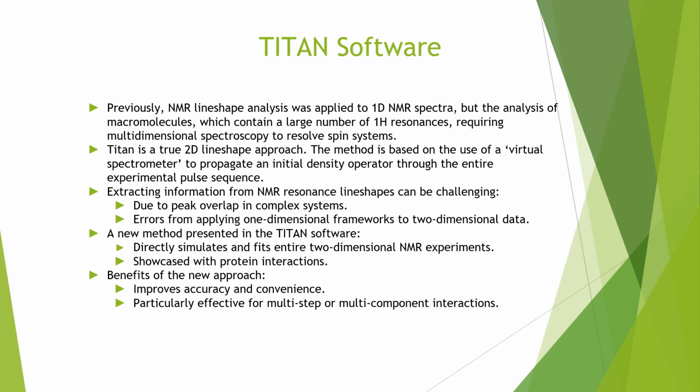This software is useful as it improves accuracy. It utilizes the bootstrap error analysis method based on resampling fitting residuals in 2-dimensional blocks. This is a unique aspect of the bootstrap error analysis method, as it considers correlation between neighboring points and provides more precise uncertainty estimates than conventional point-based resampling.